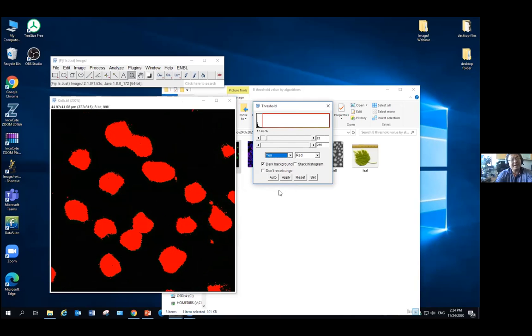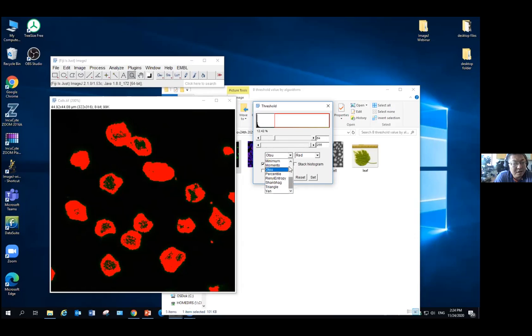So in this case, what you can do is that instead of finding a specific value, you choose what algorithm you use to calculate it. If you think, in this case, OTSU, as I mentioned, is not good, I think the Huang is good. So I will use the Huang, okay? In this image it gives a threshold of 26. When you have another image, you still use the Huang algorithm. It will calculate by the same principle, but the actual value will be different.